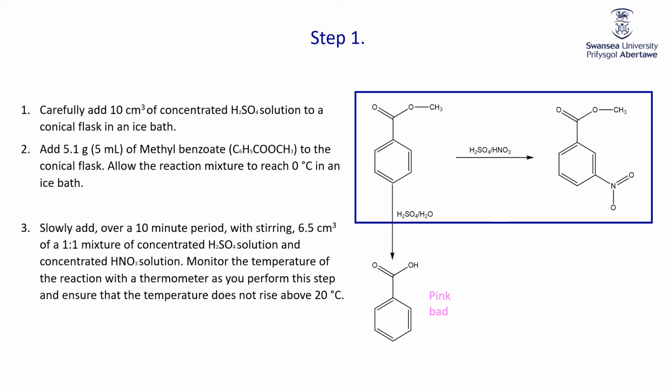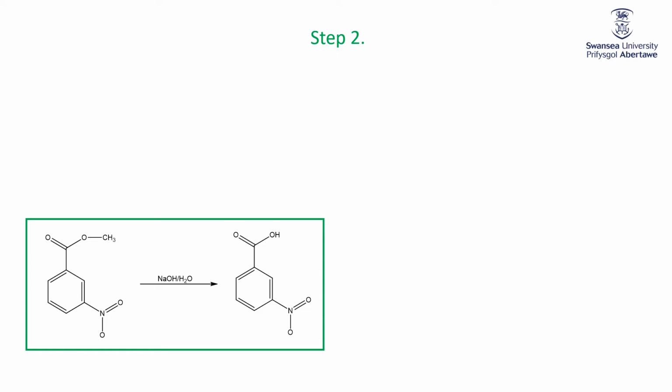Now, you have to do this whole experiment within the 3-hour lab period allowed, indeed the 2-hour and 45-minute lab period allowed. So we do it in an efficient, time-saving way. When you get to this point and you've added your first cubic centimeter of this acid mixture, then you can go to the other side of your nice big hood and you can start step two.